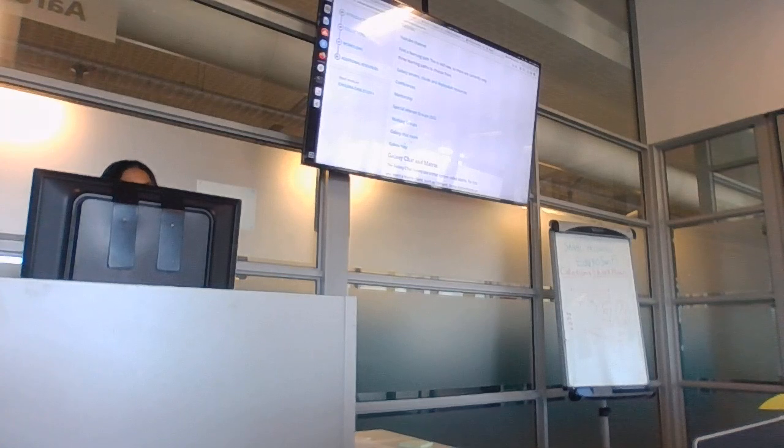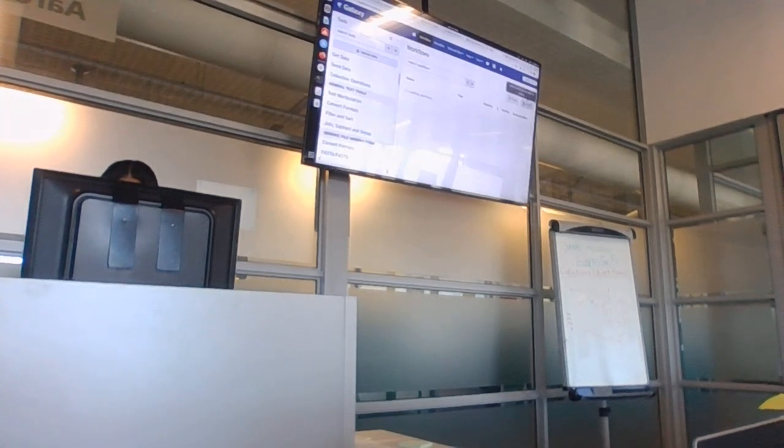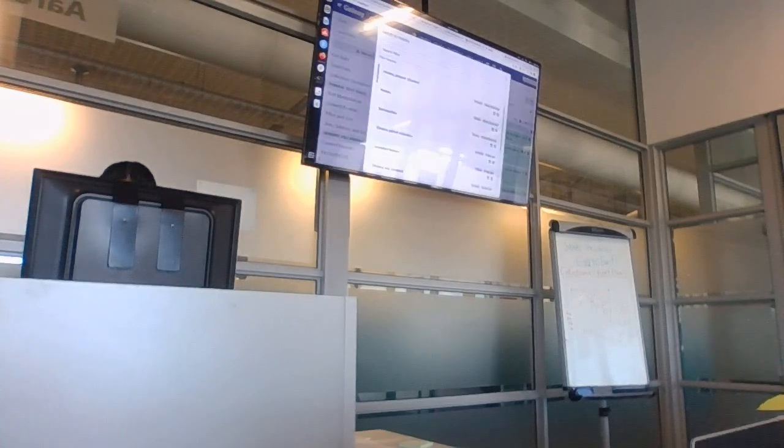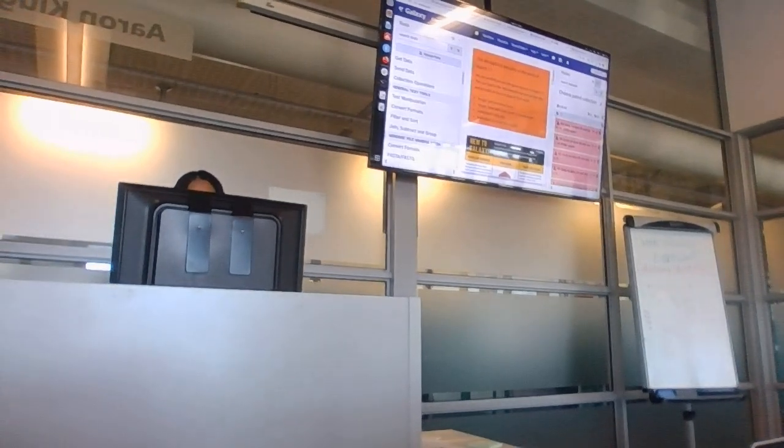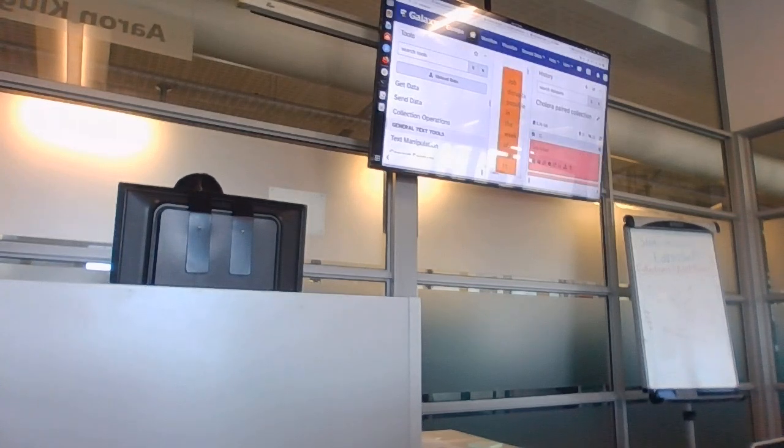If you need help, there's a chat group. Also, maybe none of you have really had this issue, but if you end up running something and you get a red result like this, you can submit a bug report. If you open it up, there's a little bug, like an actual bug. You can click on that and it usually tells you what the problem was.